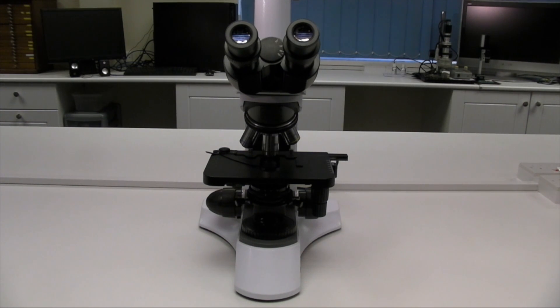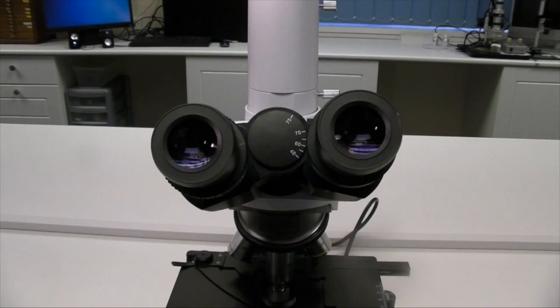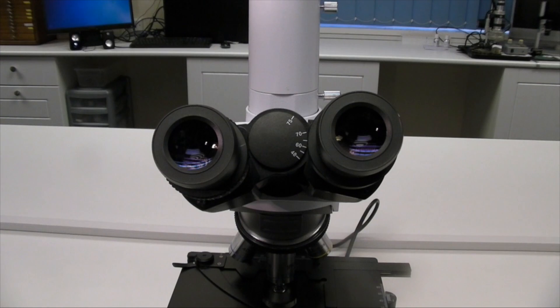Binocular microscope heads have two adjustments: the distance between the eye tubes called the interocular distance, and the separate focus of one of the eye tubes called the dioptric adjustment. There is a scale between the eye tubes which is used to set the correct distance.